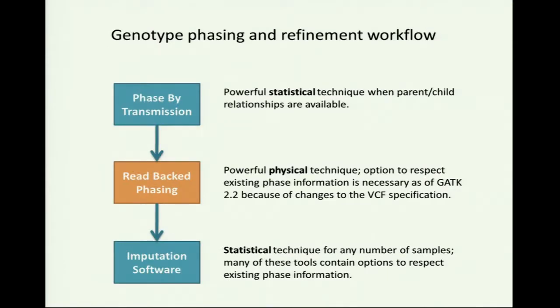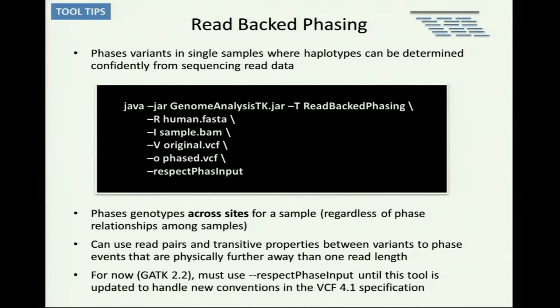But it's also the reason why, if you're trying to apply all of these, you need to go in this order, because this step will enforce the maternal and paternal haplotypes. But it's a minor detail. If you just want to do read-backed phasing, give it the BAM, give it the VCF, tell it where to stick the output. It's unphased on input, so you don't care.